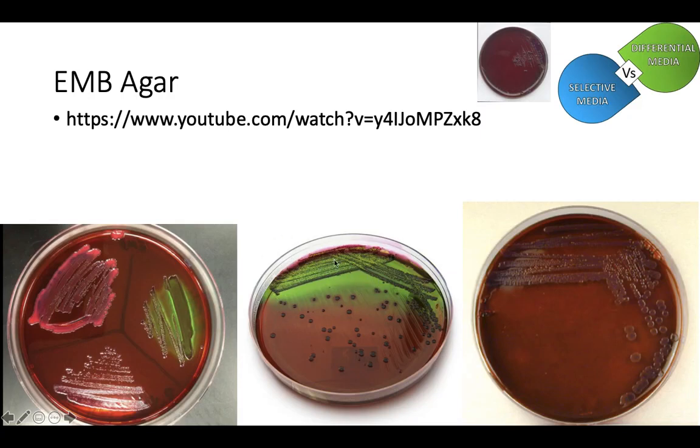Well, anyway, acid comes in contact with bacterial cell walls and cell membranes and things, and it kind of makes them a little leaky. And what that does is it causes the bacteria to suck up the dyes from the media. They suck up different types of dye. Whichever type of dye you suck up tells us what type of sugar you are fermenting. Whichever type of dye you are sucking up tells us if you can ferment lactose at all, if you suck up a dye in the first place. And then whichever type of dye you suck up allows us to tell apart the different species, and that's pretty neat.